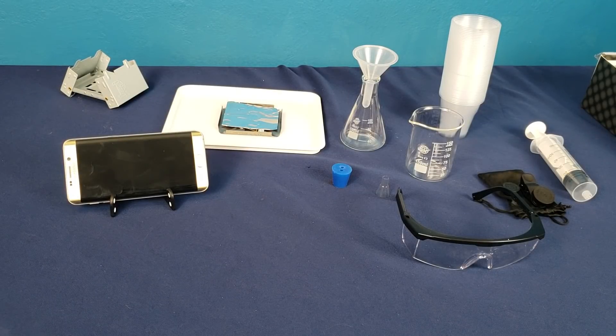So this is all the stuff that it comes with. It comes with safety gear, beakers to measure, disposable cups, syringes, a metal box to put fire out, a cell phone holder, and a tray to conduct your experiments on.